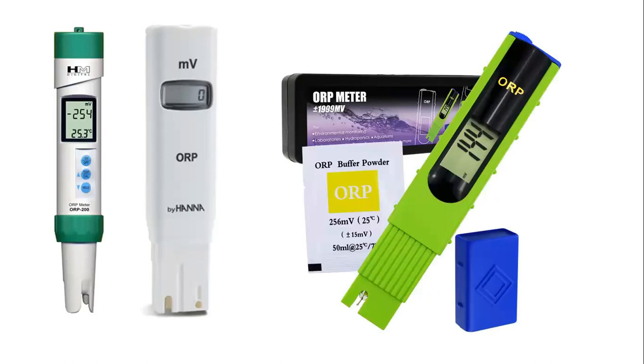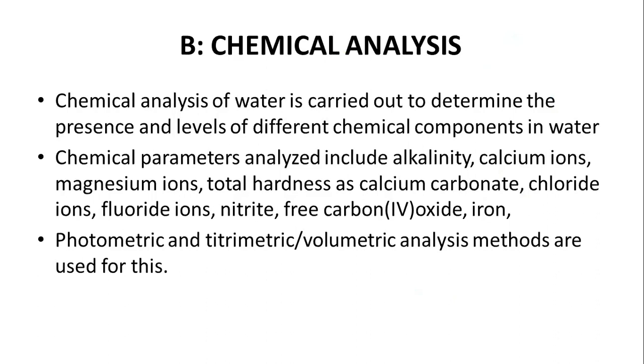We can move on to chemical analysis. We have just covered physical analysis, and with physical analysis, these are things that you can see, things that you can observe, things that you can smell. You can maybe smell the scent of your water to determine whether this water is good for drinking. You can see the color of your water and maybe get to tell whether it's good for drinking. Now we are going to tackle chemical analysis.